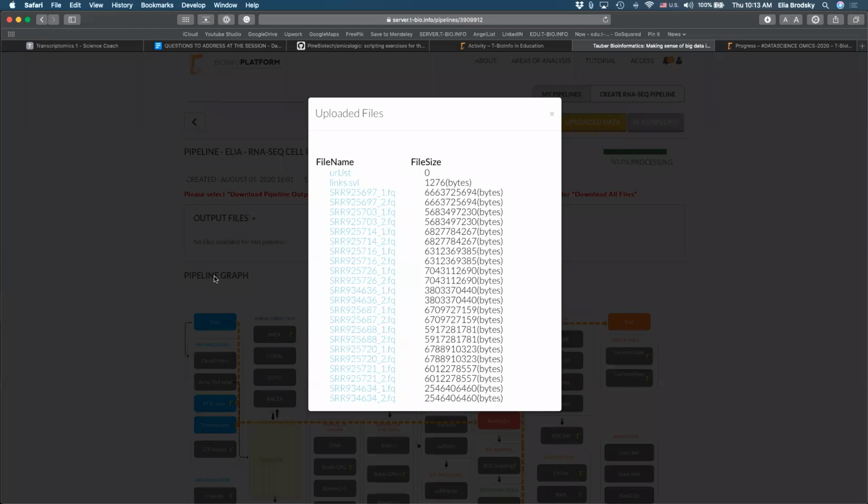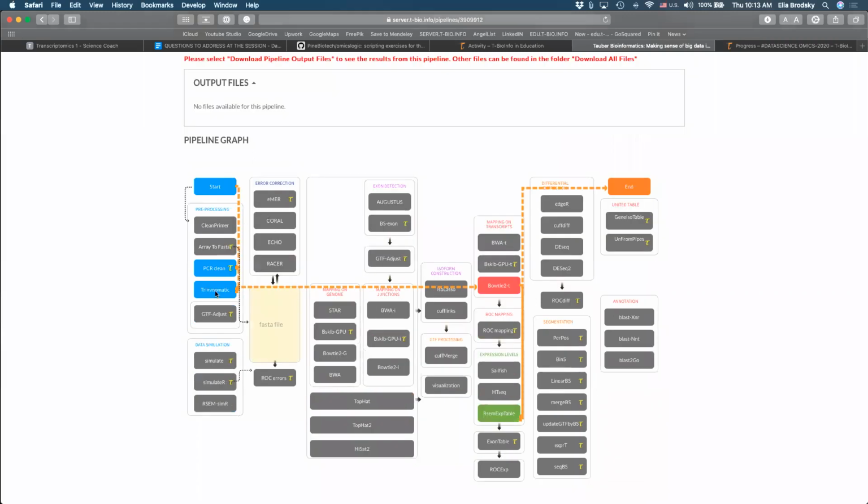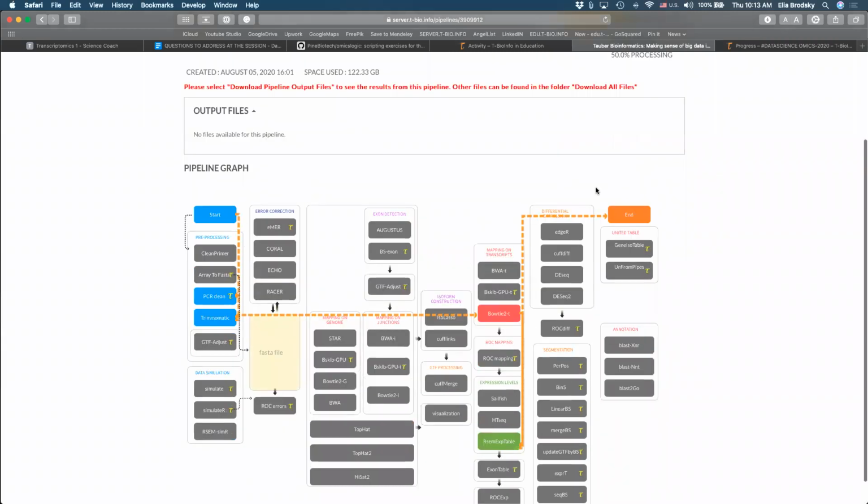What the pipeline does is it takes all the files and loads them here, saves them, converts them into cleaned up reads, saves them, converts them into SAM and BAM files, which are also large because they contain all of the information about the reads, saves them, et cetera. So this is a multiple of whatever files you uploaded.